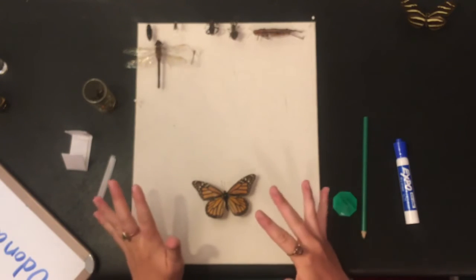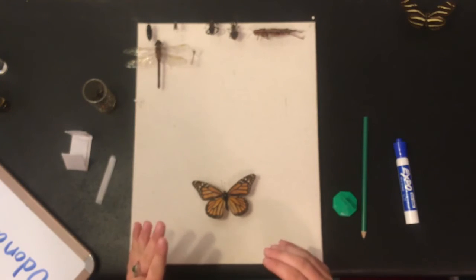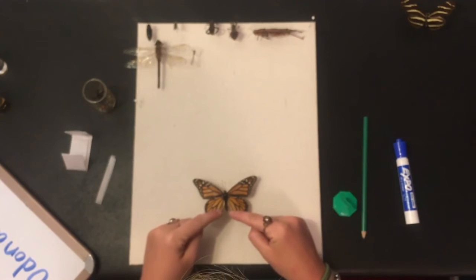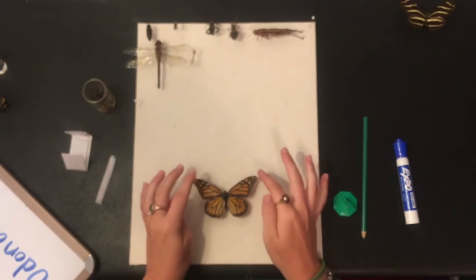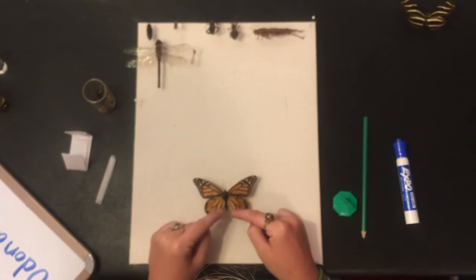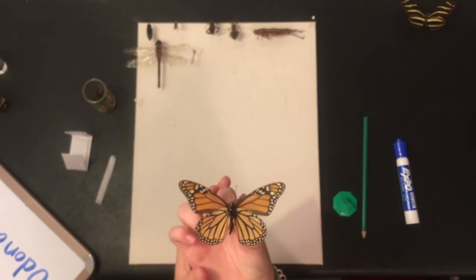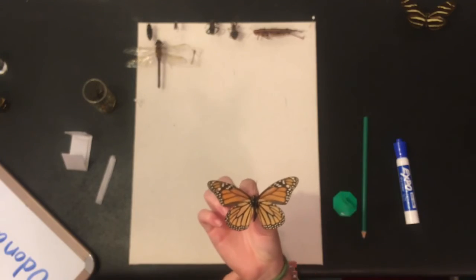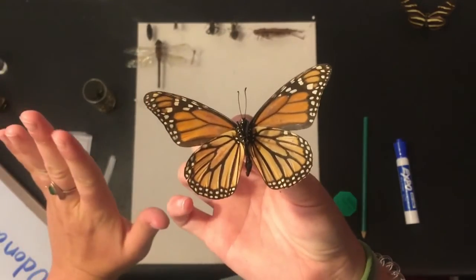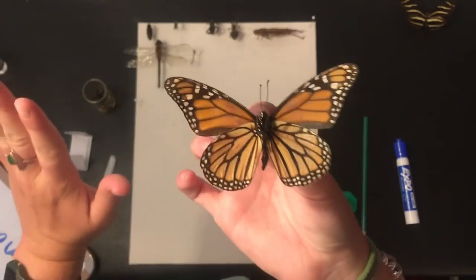The viceroy mimics the monarch, and a good way to tell the difference: viceroys have a black line that goes across their bottom wings. Viceroys don't spread all the way over like monarchs do, but viceroys also have that line. So if you ever see that line, that's a viceroy, not a monarch. Monarchs are really cool insects. I've tried very hard to preserve these guys because I love the way they look. Whenever you're pinning butterflies, make sure not to touch their wings too much, because all of the powder on their wings can come off.